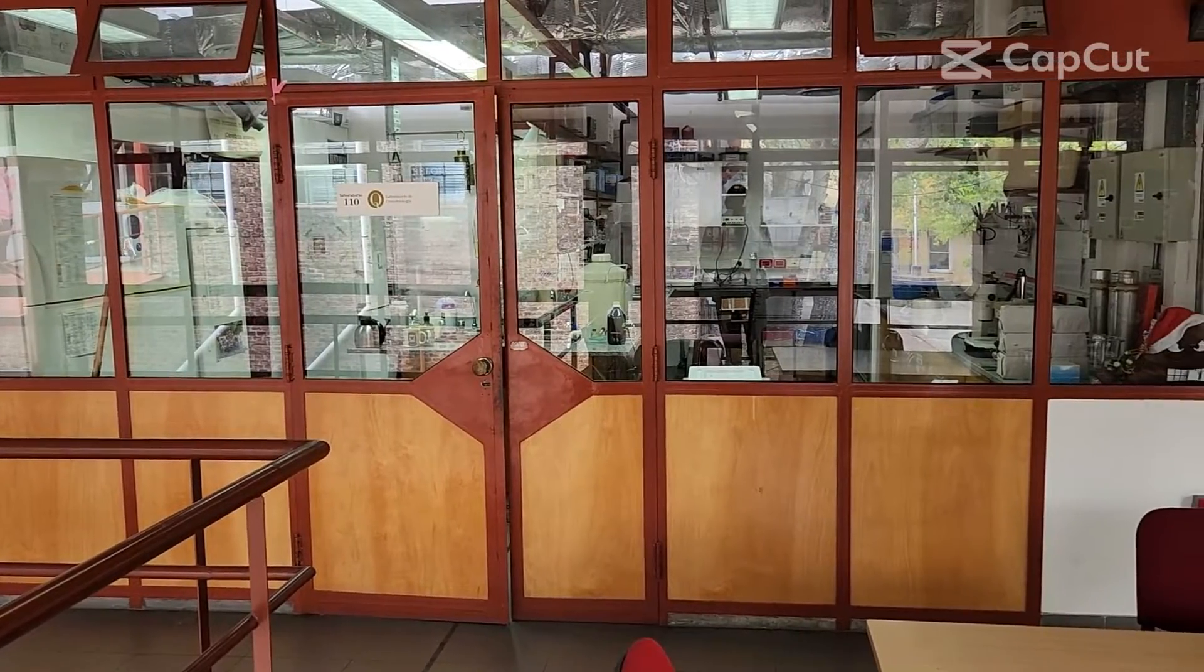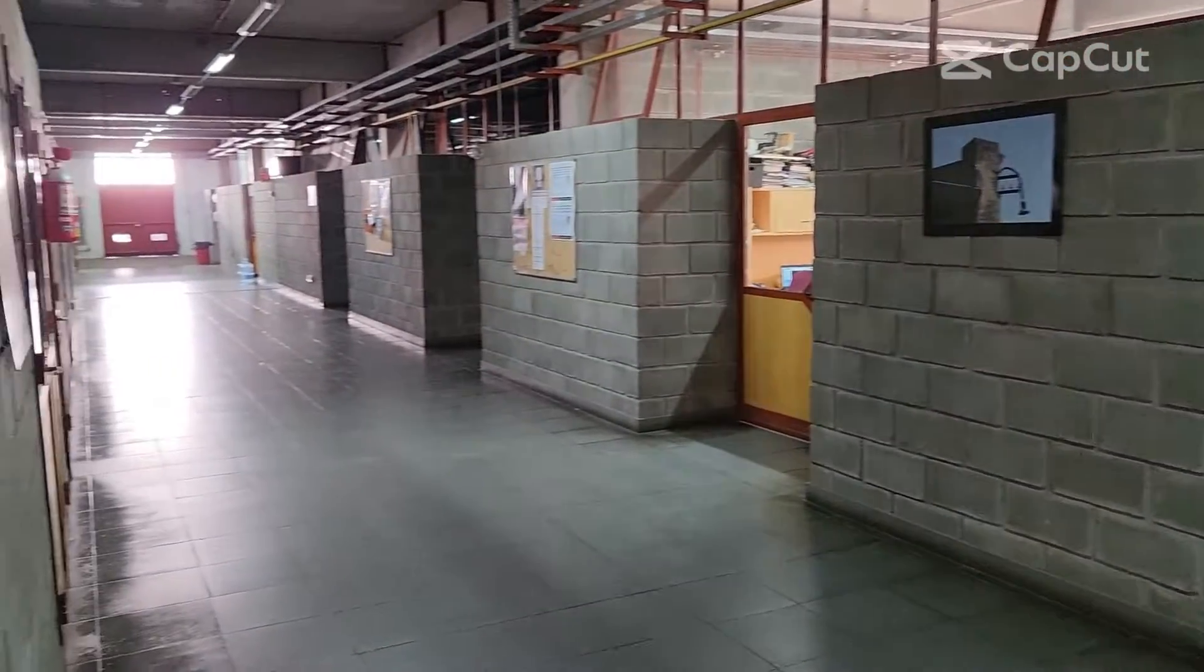Here we got the main lab, but I spent most of my time here, in the Worms lab.